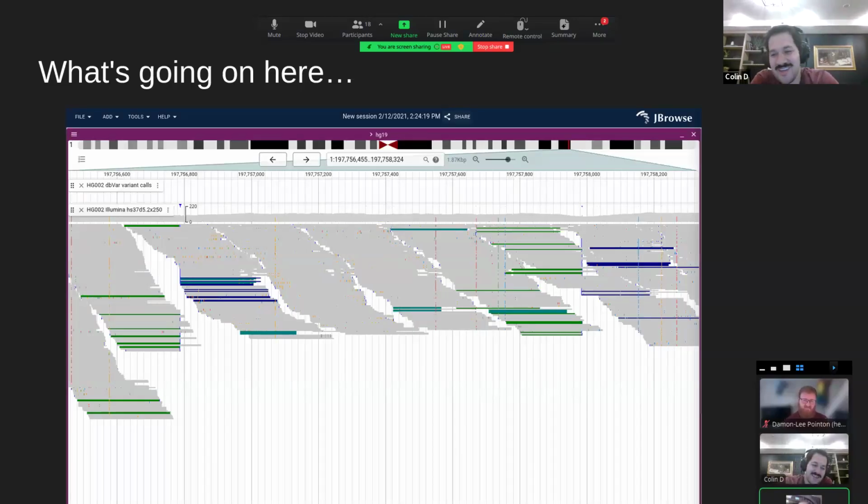So as I diverge, this part of my talk I didn't plan very well, because I thought I'd just dump a bunch of screenshots at everyone, but I thought I'd start with how we tried to think a lot about what we could do to help visualize things like structural variants. And so this is a pretty classic thing where you have your BAM file and your reads are colored different colors according to which orientation the pairs are pointing.